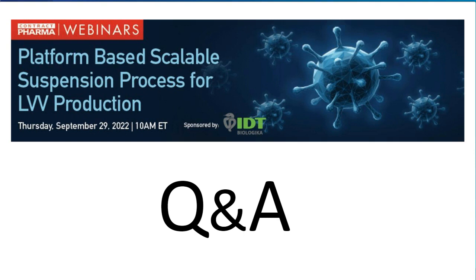Okay, and this next question jumps off that one and asks, do you have any information on how complexation time affects transfection efficiency? And is there any limit on it? Yes. So complexation time, like I was saying earlier, is one of those things that doesn't necessarily increase the titer, but it could significantly decrease it if you get it wrong. So the manufacturer recommended time for complexation with our transfection reagent, which is PEI Pro, is about 15 minutes.